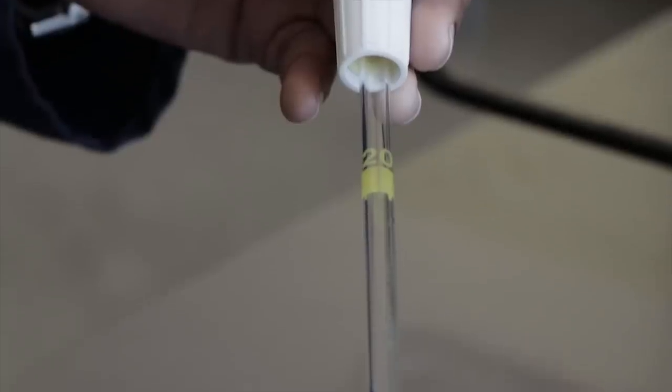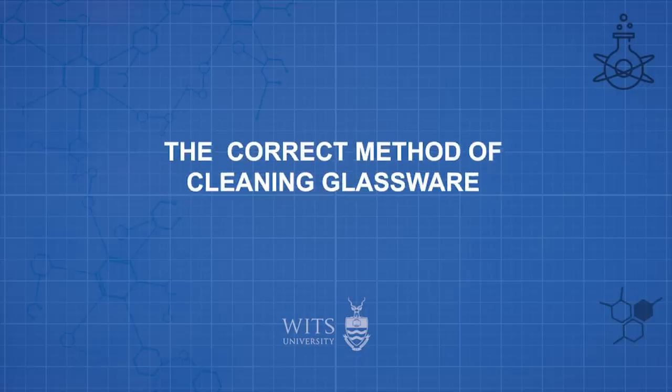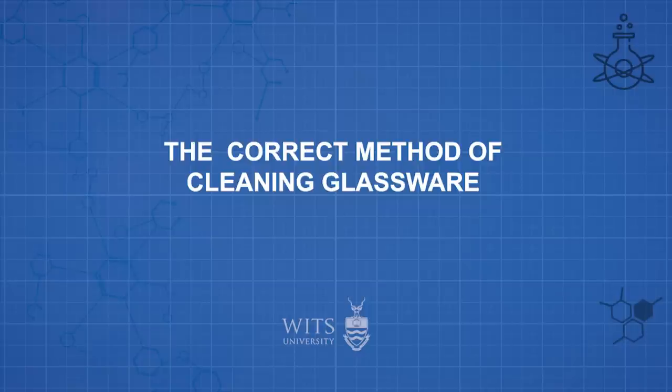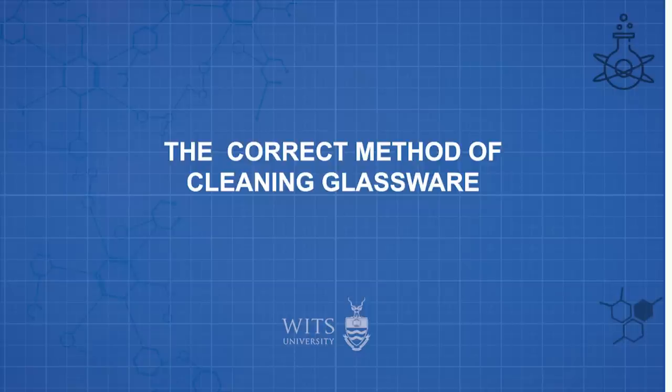Furthermore, both the burette and the pipette are volumetric pieces of glassware. Here is the correct method for cleaning the glassware that you'll be expected to utilize during your practicals.